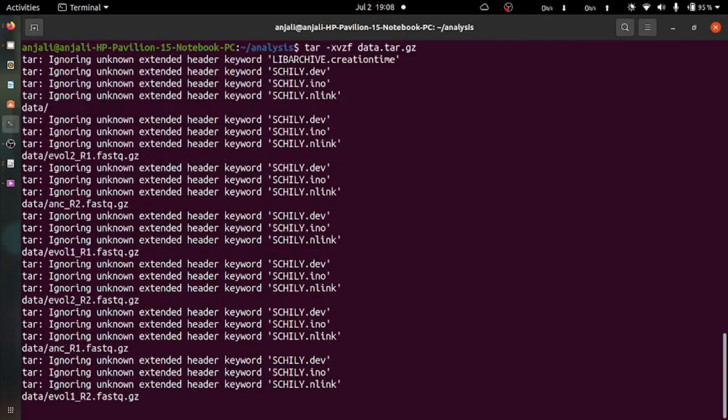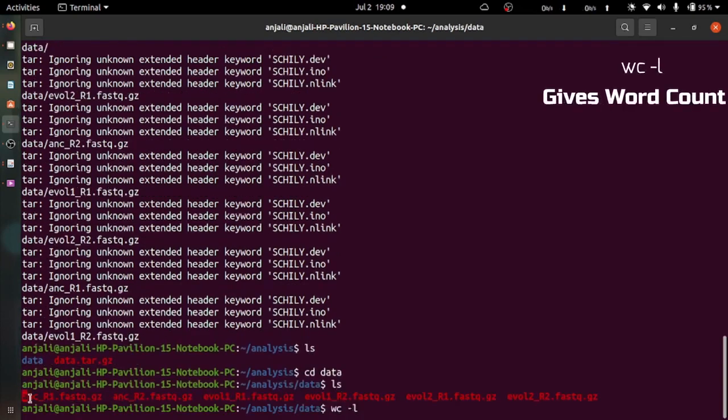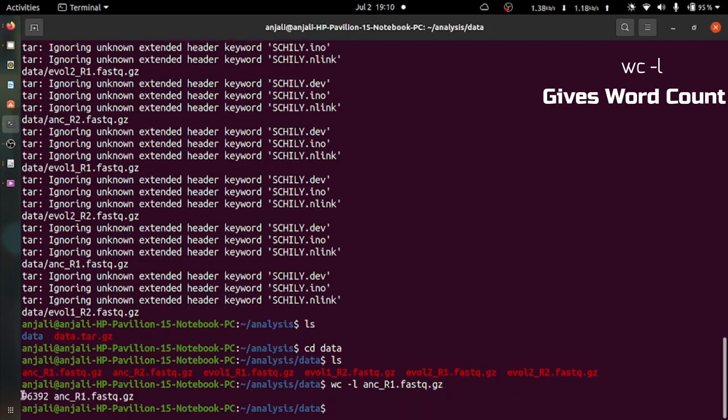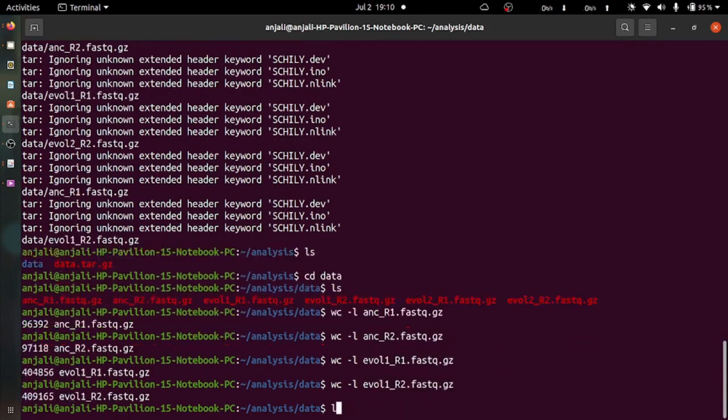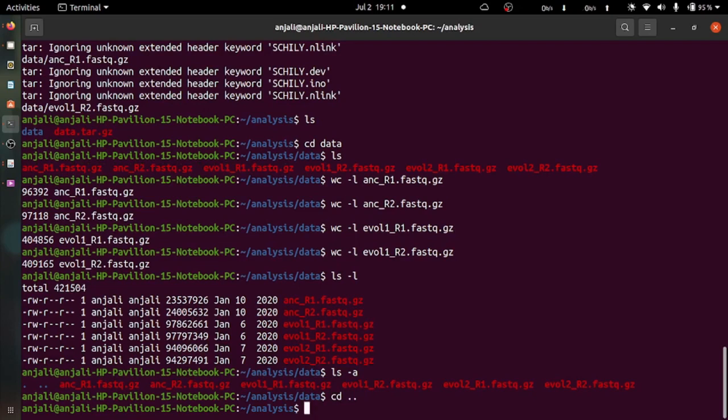Here we are using paired-end sequencing run data from Illumina HiSeq. Thus, we have two files, one for each end of the read. There are a few steps one needs to do when getting the raw sequencing data from the sequencing facility: adapter trimming, quality trimming of reads, and quality assessment. Now we'll use the FastP tool to trim adapters and do quality trimming.